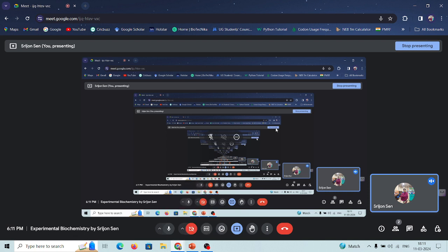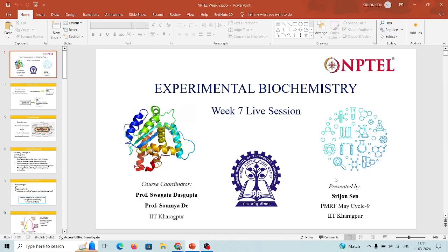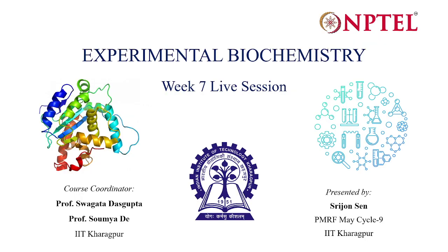So before we directly jump into the main topic, we discussed amino acids, we discussed proteins. Also, we spoke about the separation techniques of proteins. So today's lecture will mostly deal with the isolation and the characterization of proteins. This is a continuation of the last class, where we talked about the different types of chromatographic techniques. There we talked mostly about macromolecules or biological macromolecules. Here we would be mostly focusing on proteins.